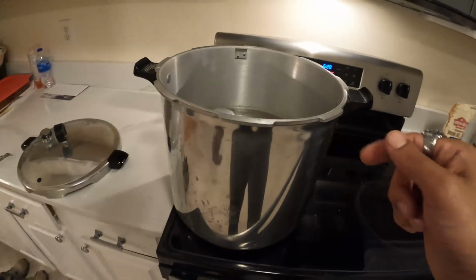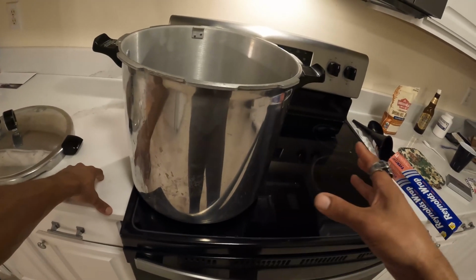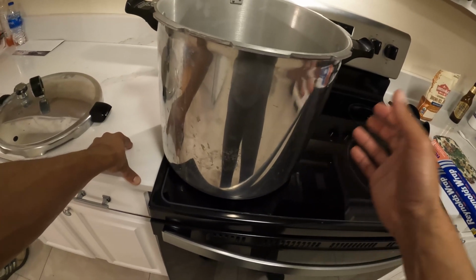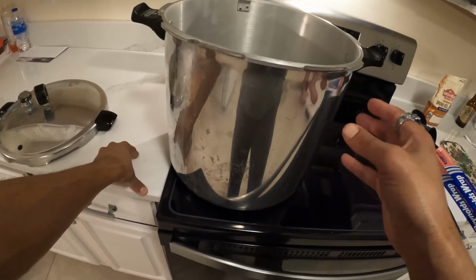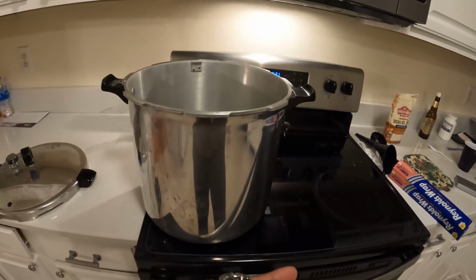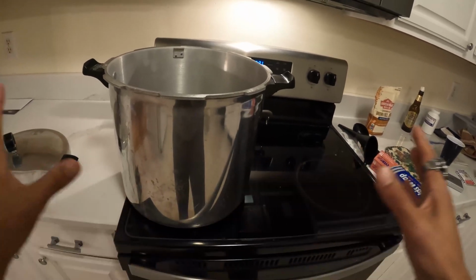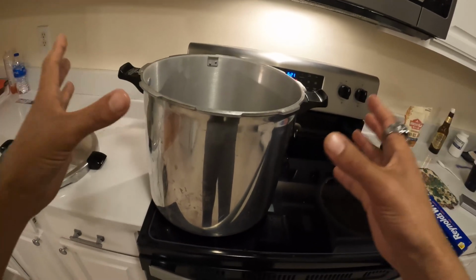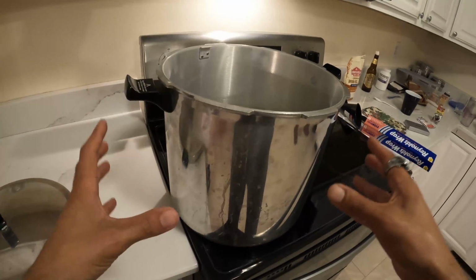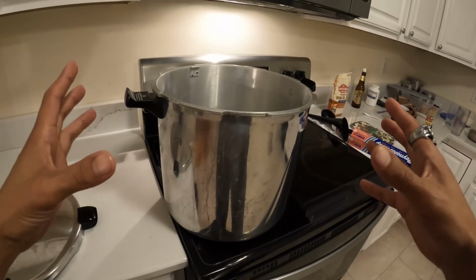It's very annoying that this has become a gatekeeper. Just a few years ago, before the world went crazy, I was able to get this pressure cooker off of Amazon for $70, and that included shipping. To date, this same pressure cooker is $140 with shipping. I don't get it. It's stupid. Don't let that stop you from obtaining a pressure cooker. This is a 23-quart pressure cooker, and it lasts for years, so it's worth the investment.